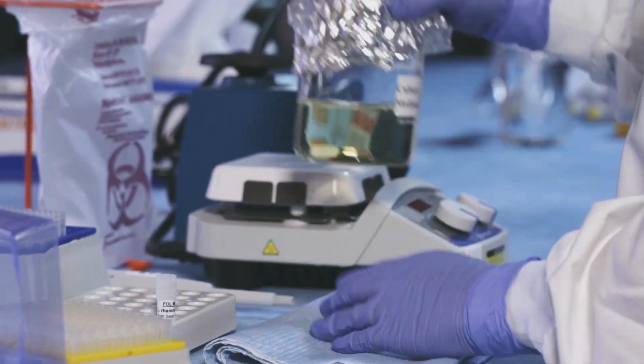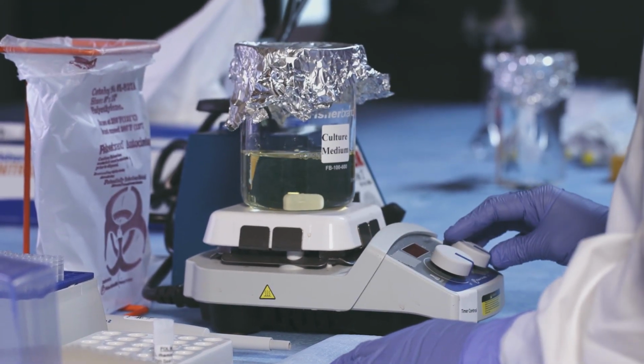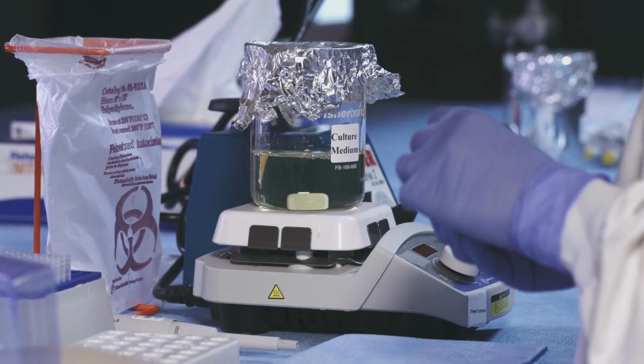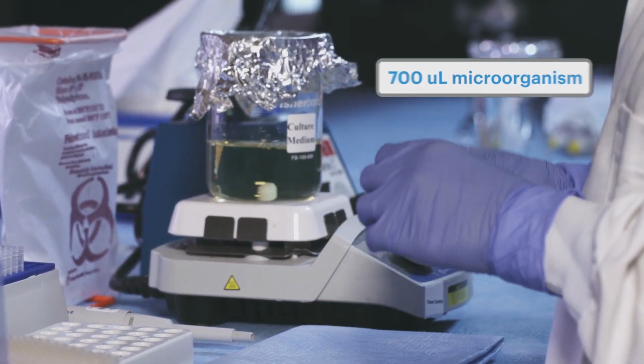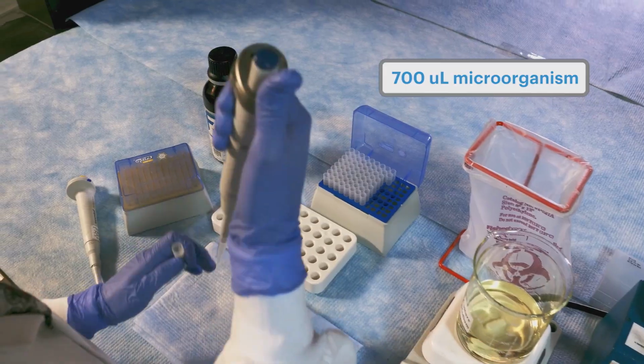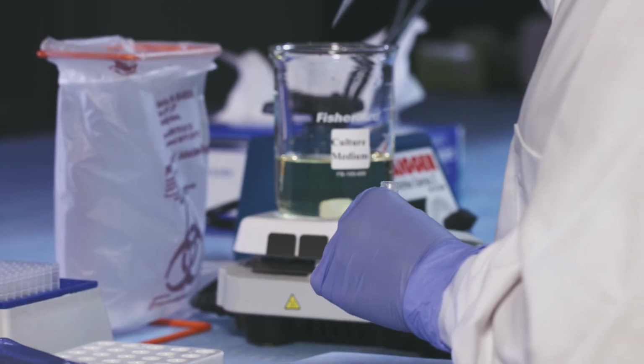Mix well for a few minutes. Thaw a vial of frozen microorganism and add 700 microliters of the inoculum to the medium. Stir gently.